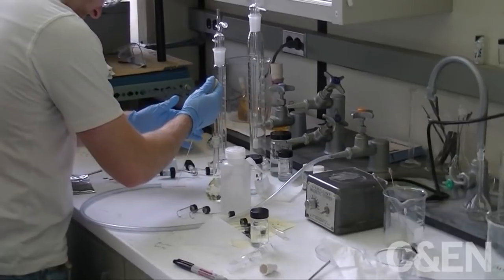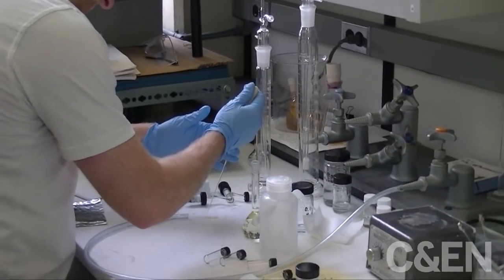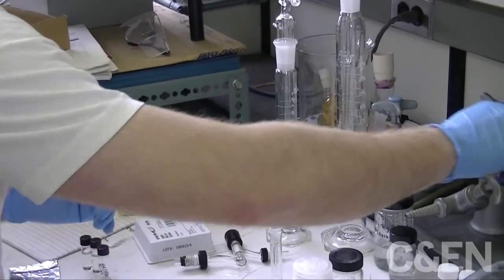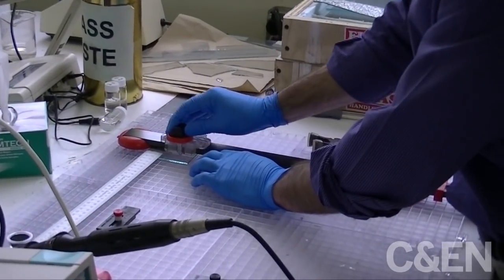Every lab tweaks the procedure to suit its research focus, but many of the steps are common to all researchers studying perovskite cells. These solar cells, or photovoltaic cells, are typically made in a layer-by-layer fashion on a specially coated glass support.